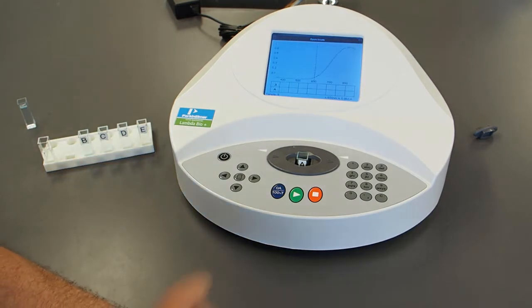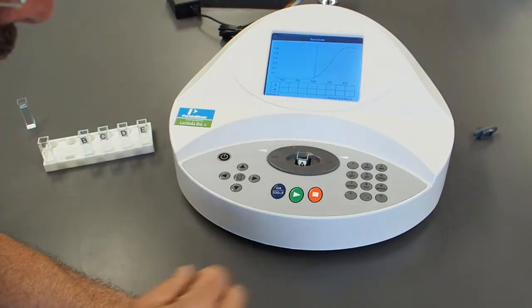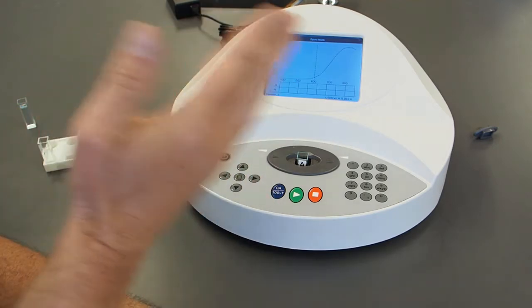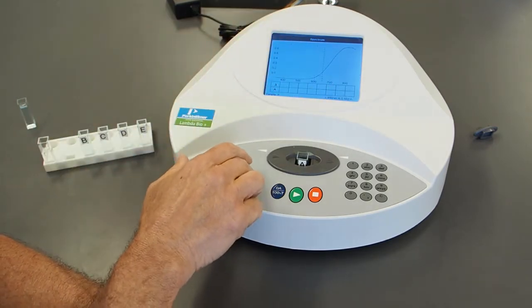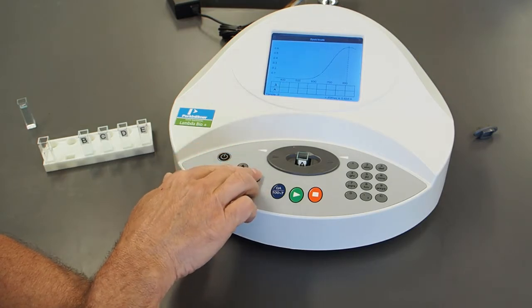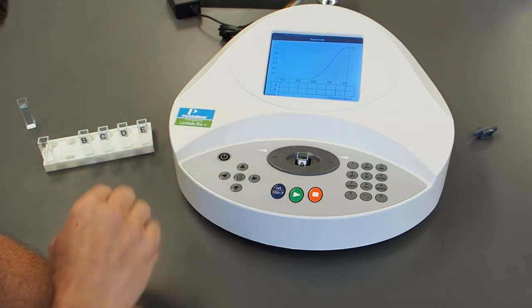And what we see is that you generally want to take the maximum of the absorption spectrum, so that if the wavelength ranges a little bit left or right, it doesn't change the absorbance very much. So we're going to move over to there and choose a wavelength somewhere near the top here. Let's say that's 807 nanometers, looks pretty good. Let's go to 800 and let's go to 810, make it for that.